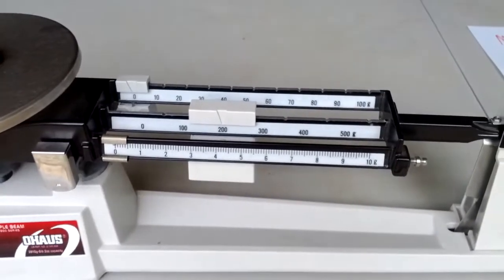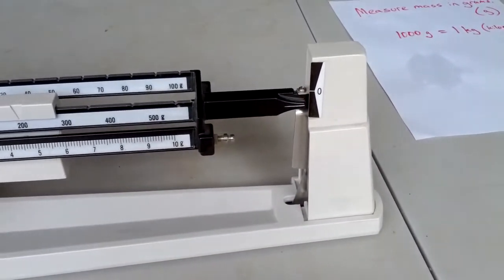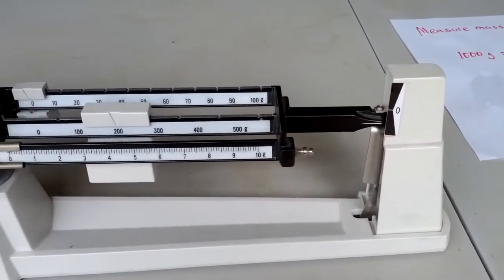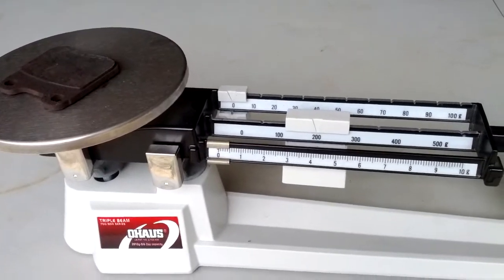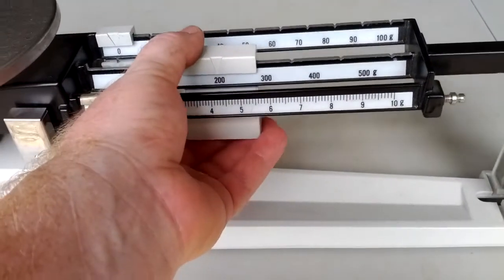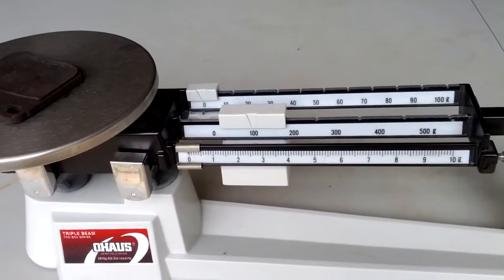When I slide it to 200, notice how the balance went all the way down. That's too far. That means this brake pad has a mass of less than 200 grams. So I need to go back to 100. So I'm going to slide that back over to the 100 mark.